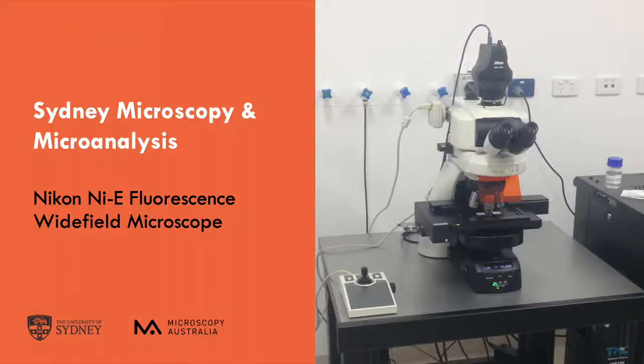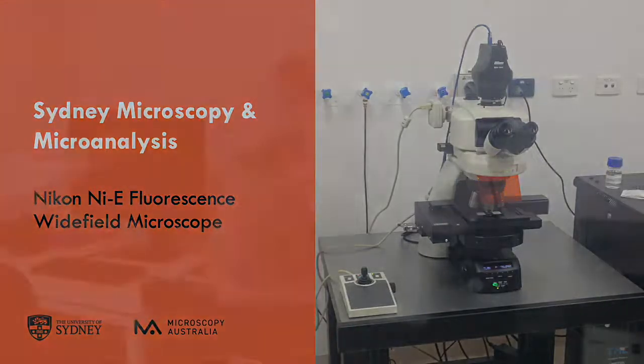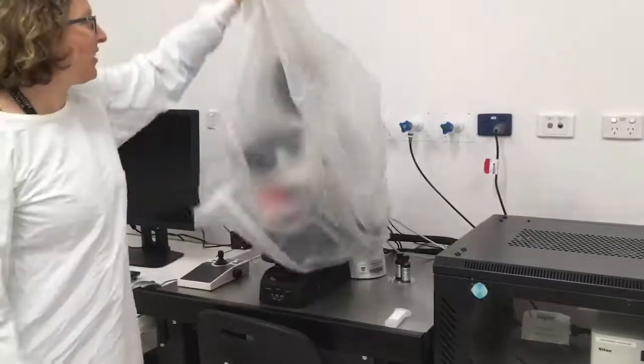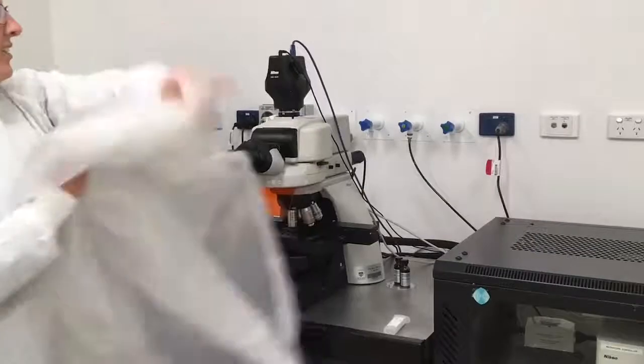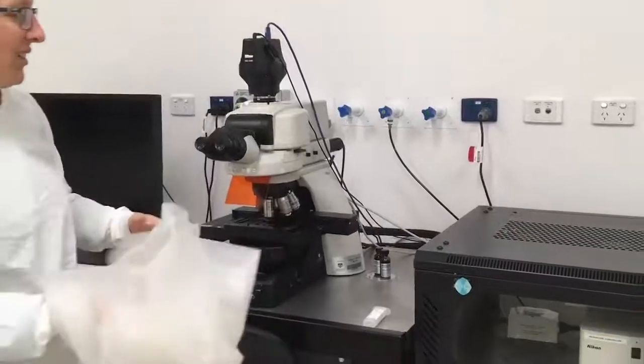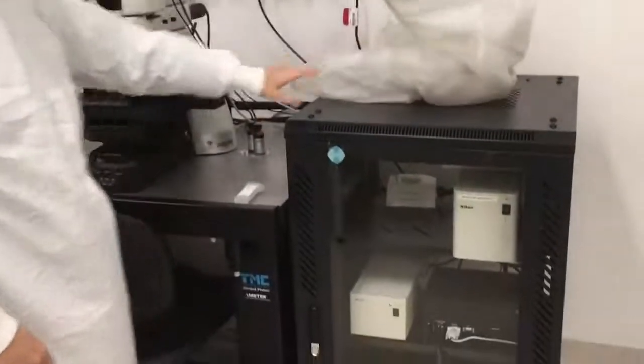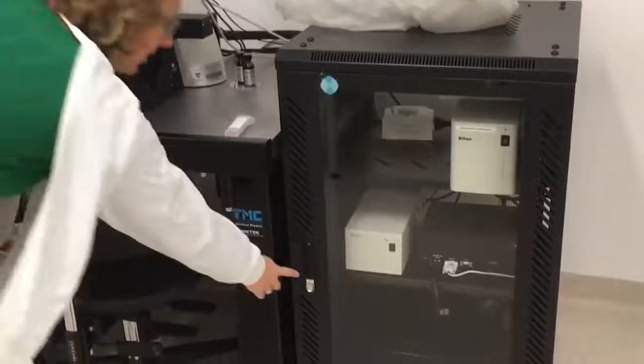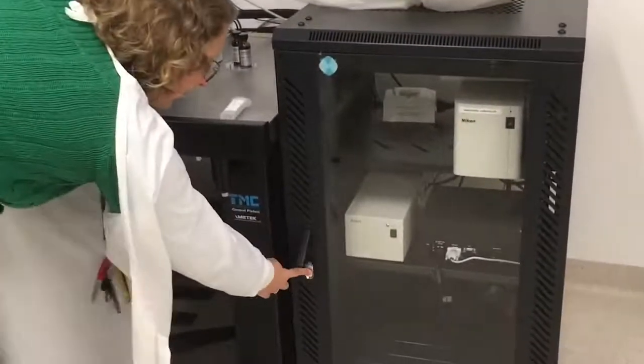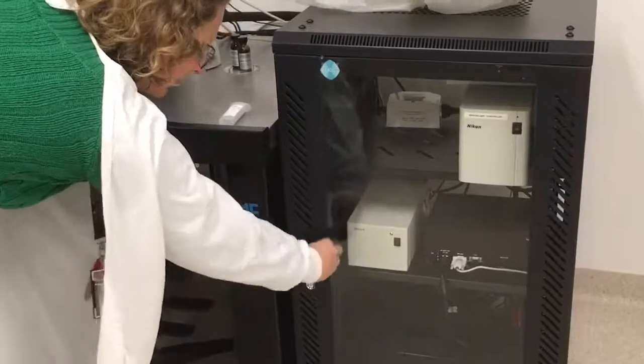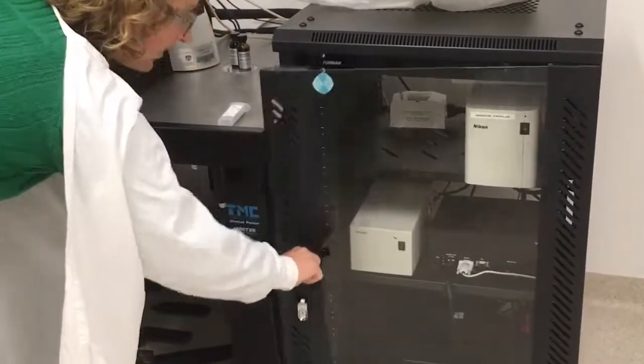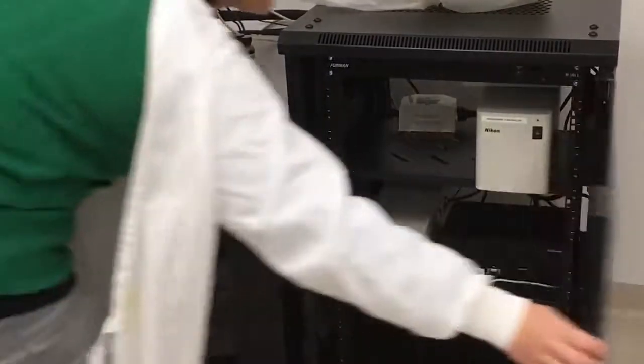To start up the Nikon NIE wide-field microscope, first remove the dust cover and set it to the side. Then open the component box. Press the keyhole, then turn the handle to the side to open the door.